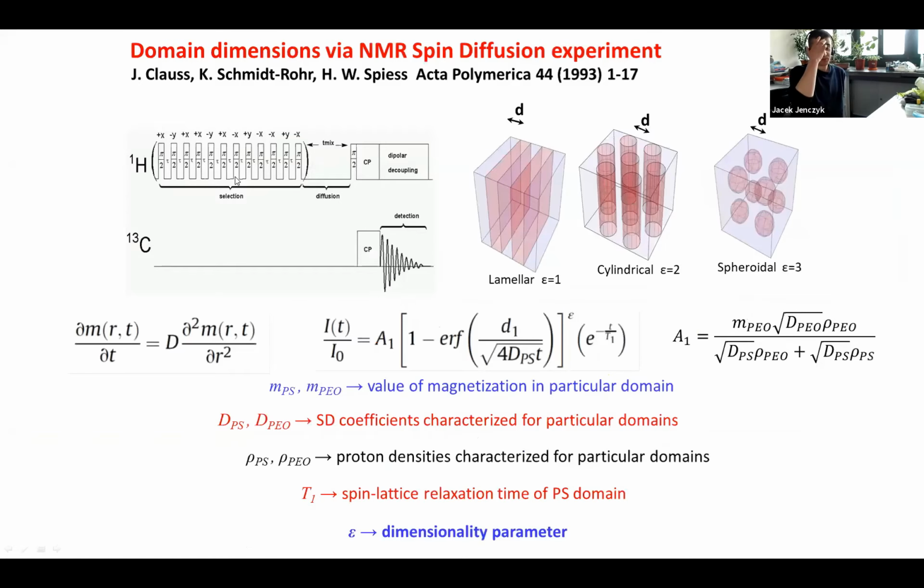But okay, let me skip to, I started with some microscopic data to really show you that the diblock copolymers are very interesting and might be potentially very useful in the future, let's say, in nanolithography and microelectronics, because in general we may produce quite unique nanoscopic patterns using this approach.